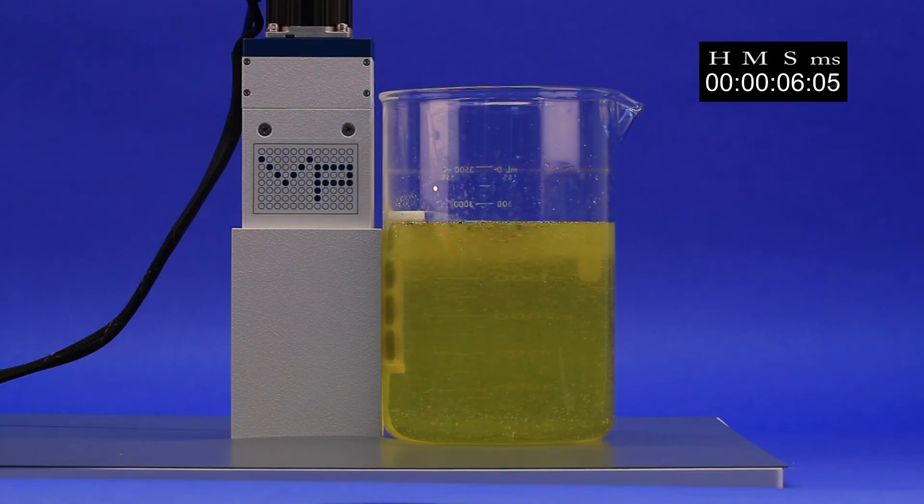This is vegetable glycerin, which is viscous. You can see how the VP710C5 can easily stir a large amount of viscous solution.